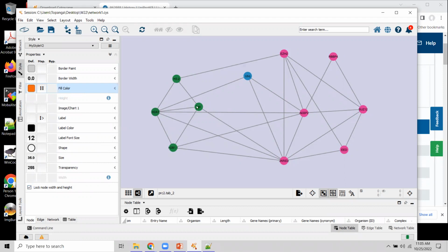Our sticker shows up smack in the center of dots that might be bigger and smaller. So one option is to make those dots start from a large enough size to have the sticker in. Another option would be to move the sticker to the side. Both are viable. Let's try to do the simpler thing. Let's try to make those things bigger. Okay. So to control the size, we need the size of the node here.